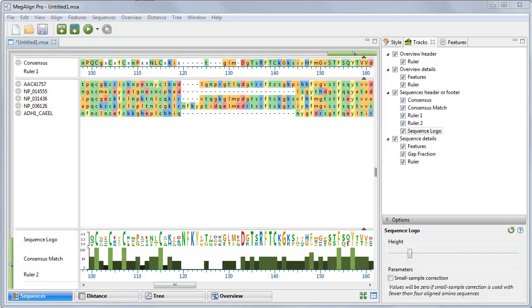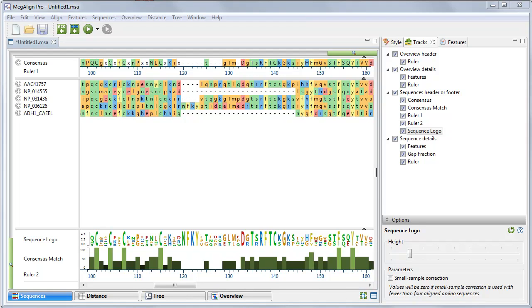Now we'll go to the Sequences view to see how tracks are controlled there. This pertains equally to the Overview, but due to the limited screen space in this video, I've chosen to expand the Sequences view to take up most of the screen. To see the detailed tracks that were checked in the Tracks panel, you first need to expand the tracks.